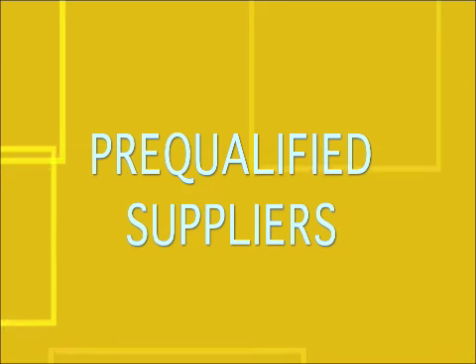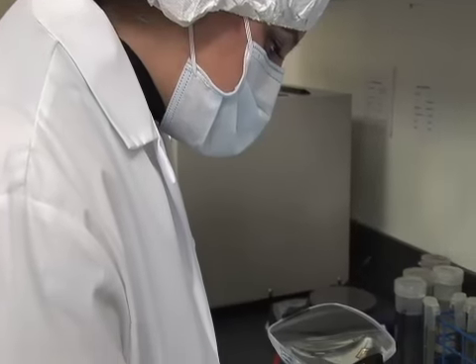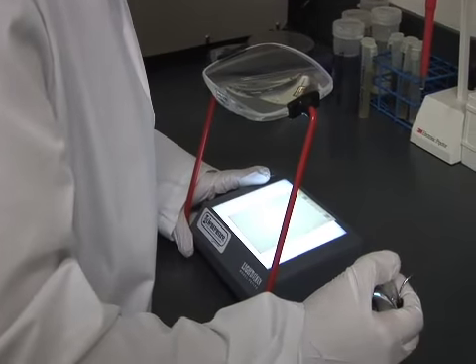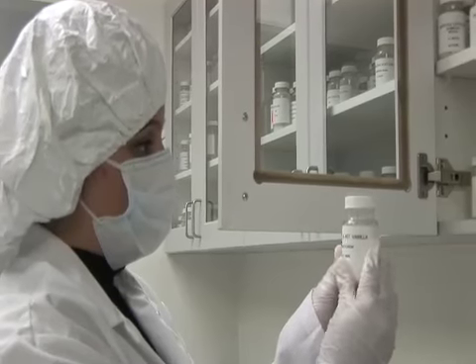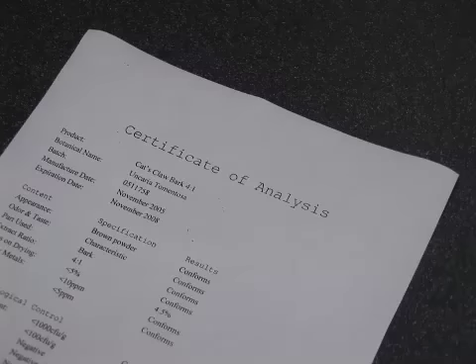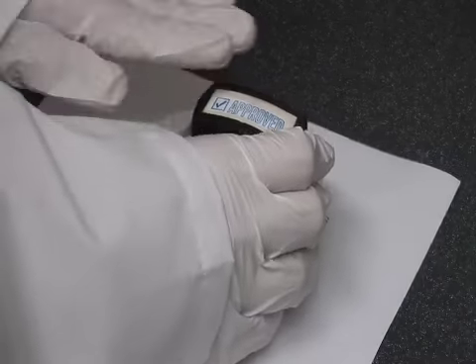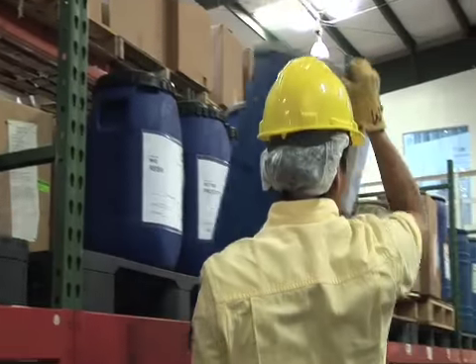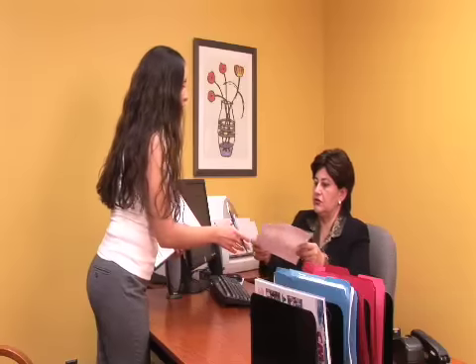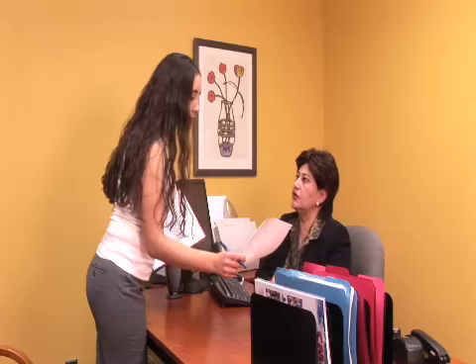We deal only with raw material suppliers that we have pre-qualified. Nevertheless, we take nothing for granted but verify each ingredient that we receive. The QC department keeps a sample of the raw material in its library of retained ingredient samples. Once all test results show that the powder is okay, the QC director approves its release from the quarantine for use in production.